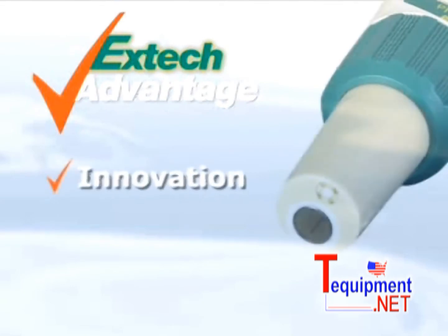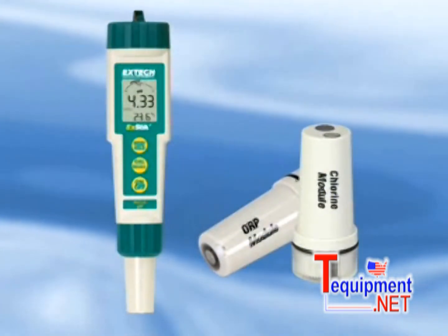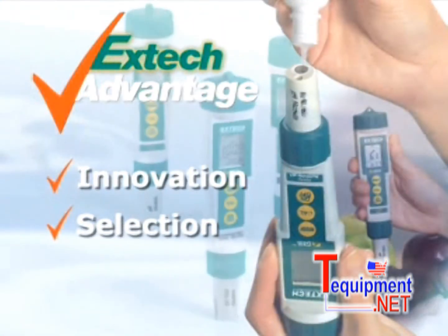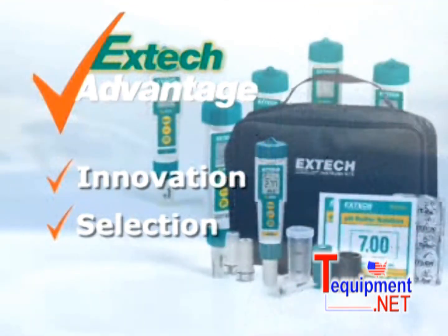EXTIC stresses on innovation to help you solve your day-to-day problems by using the latest technology. The EXTIC pH meters are also designed to measure chlorine and ORP by changing the electrode module. We offer a selection of meters and accessories to meet your application needs, and also EXTIC kits for your convenience and added value.